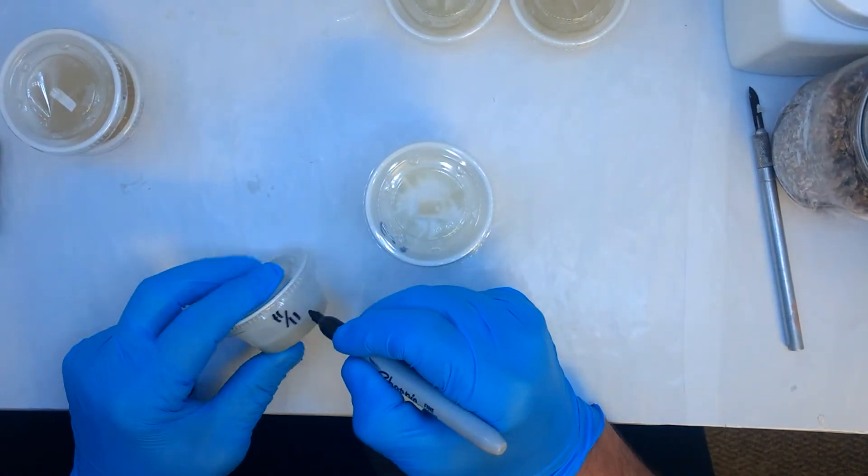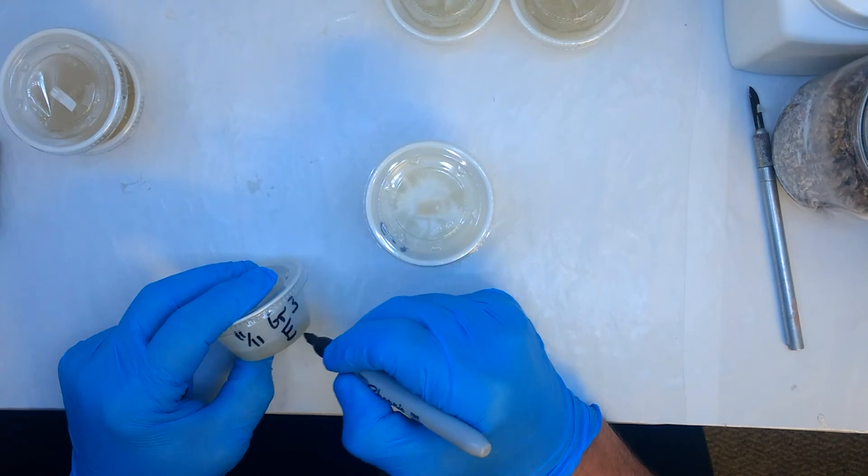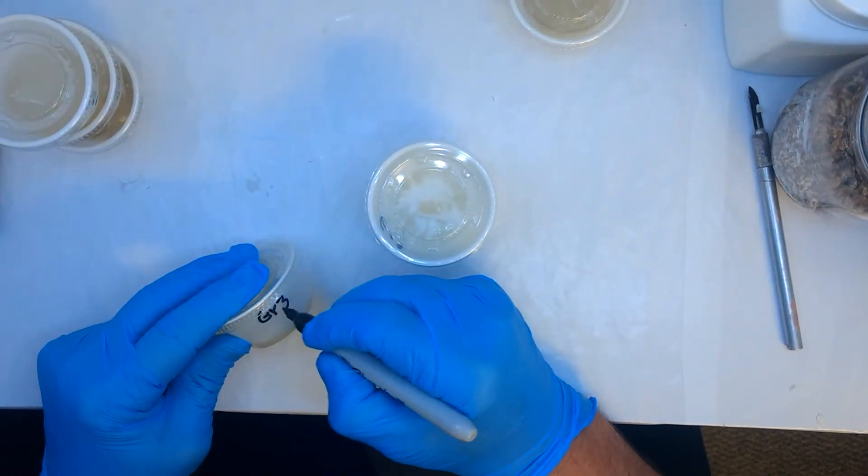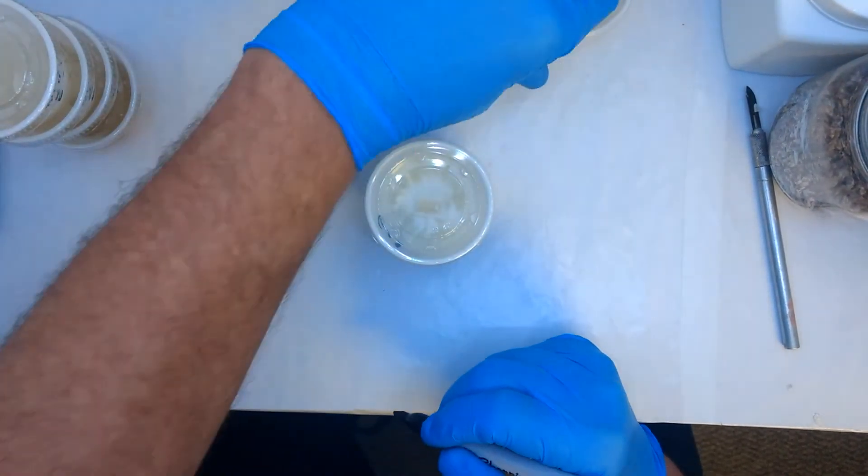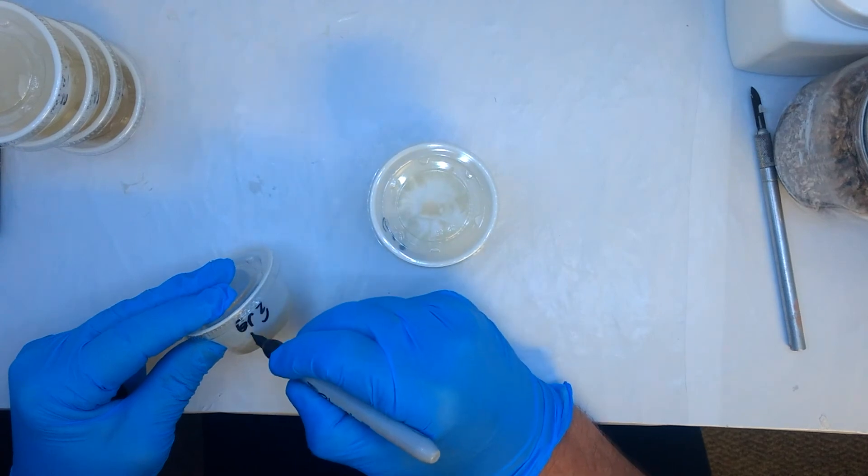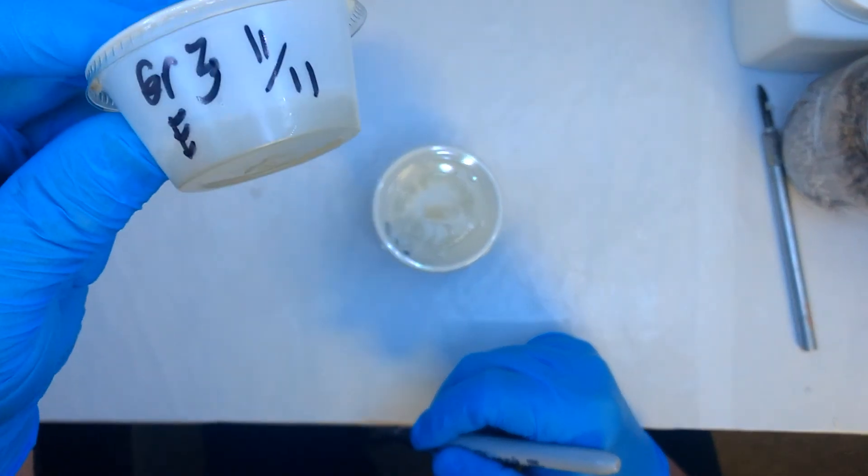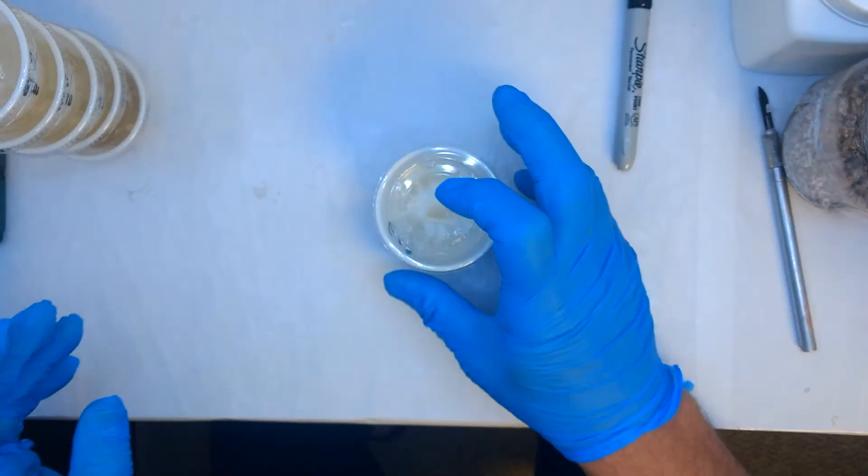In case someone else comes down to work or do some work for you, whereas GR is Grain, E is, I went from A to Z, E is just another label on the grain, and the date of course.